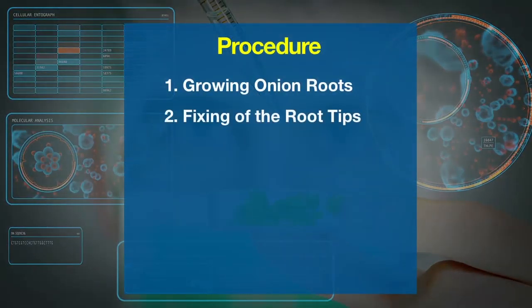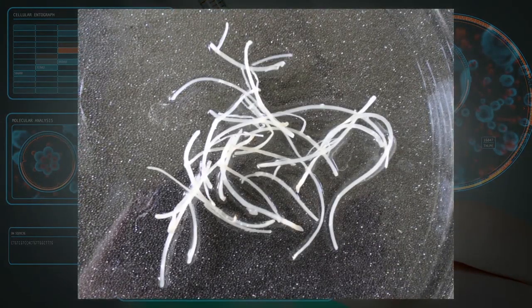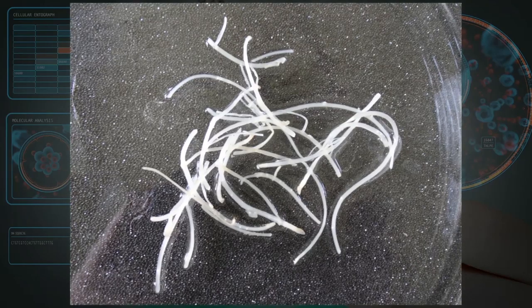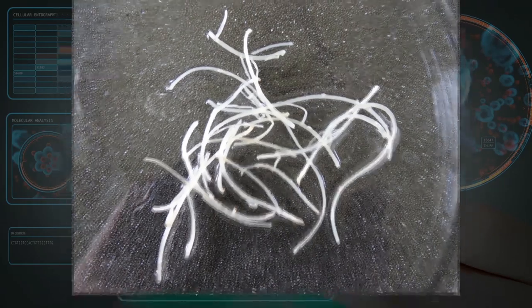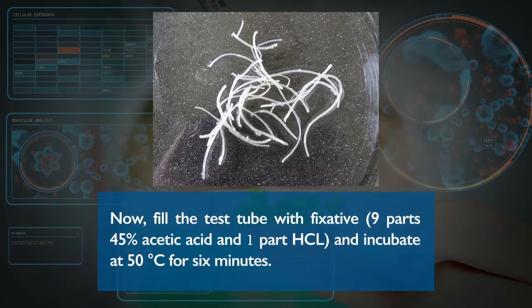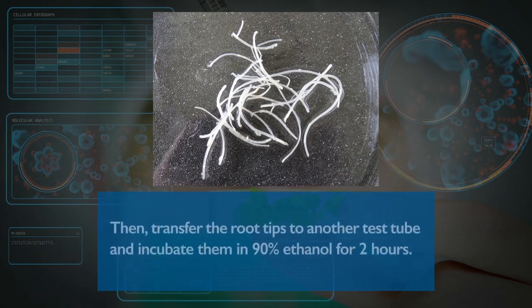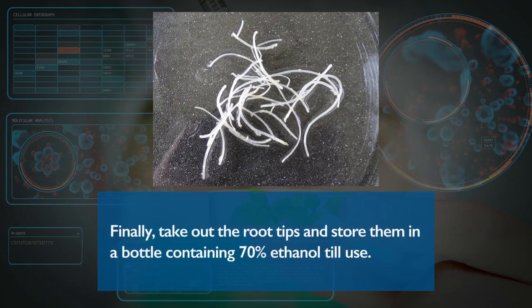The next step is fixing of the root tips. To harvest the root tips, take the onion bulb and cut off about 1 cm long pieces of the root tips and transfer them into a test tube. Fill the test tube with fixative and incubate at 50 degrees Celsius for 6 minutes. Then transfer the root tips to another test tube and incubate them in 90% ethanol for 2 hours. Finally, take out the root tips and store them in a bottle containing 70% ethanol until use.